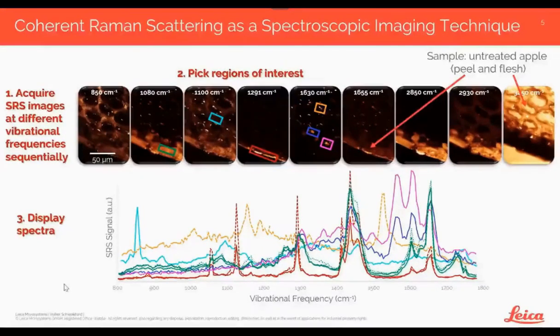How much average power is required for multi-photon, TPEF, SHG, images acquired with picosecond pulses? Okay, that's a great question because we get this question a lot. There seems to be a conception that two-photon fluorescence microscopy is only possible with femtosecond pulses. But of course, that is not true. The picosecond pulses, yes, they are longer and therefore they contain a lower peak power, but they are still able to excite such multiphoton fluorescence processes quite efficiently. Not quite as efficiently as femtosecond pulses, but still quite okay.